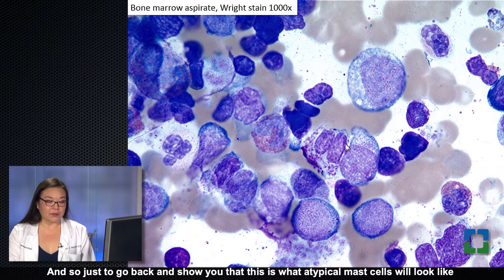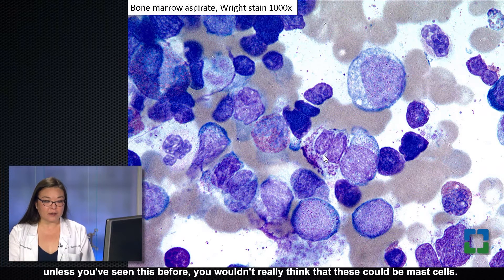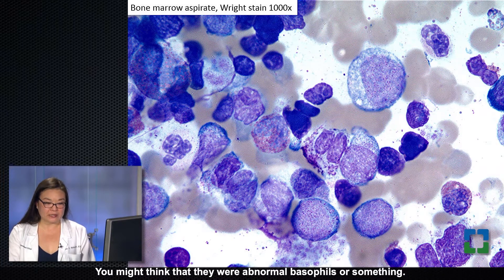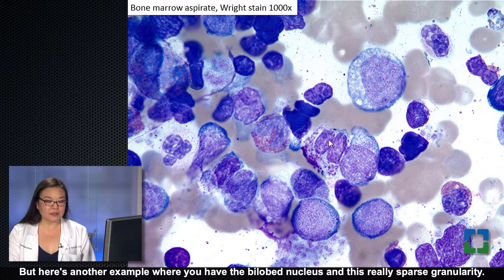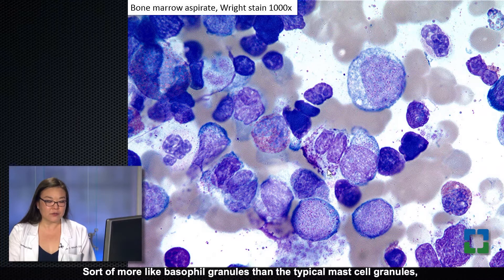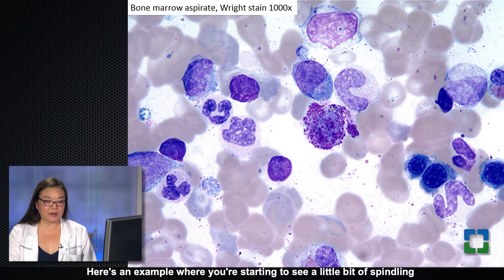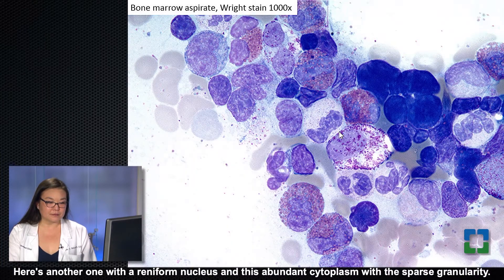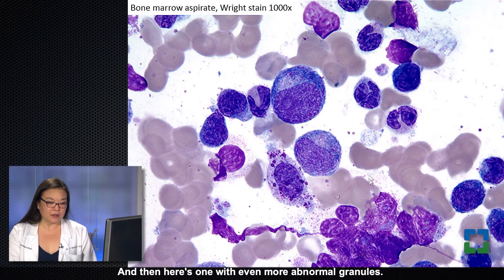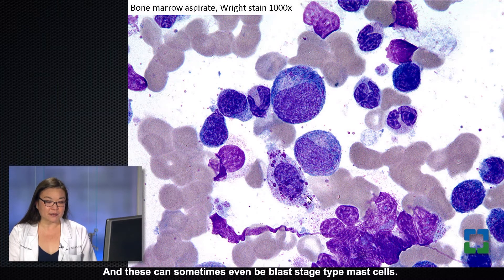Just to show you what atypical mast cells look like in the bone marrow — because they look so different from normal mast cells that unless you've seen this before, you wouldn't think these could be mast cells; you might think they were abnormal basophils. Here's an example with a bilobed nucleus and really sparse granularity, more like basophil granules than the typical darker purple mast cell granules that completely fill the cytoplasm. Here's an example where you're starting to see spindling of the cytoplasm, and another with a reniform nucleus and abundant cytoplasm with sparse granularity, and even one with more abnormal granules that can sometimes be blast-stage mast cells.